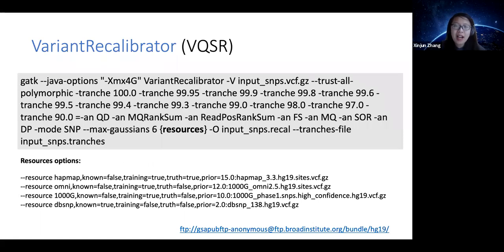This is specifically how your input should look. This looks really crazy, and I'm sorry about that. There's no way around it. So let me try to break this down to what exactly it is. Again, the best explanation for what exactly each of these functions does and why the inputs are set as they are, the best way to find that out is to go back to the GATK pages. There are really detailed explanations out there that will be very helpful for you to understand what exactly these inputs are.